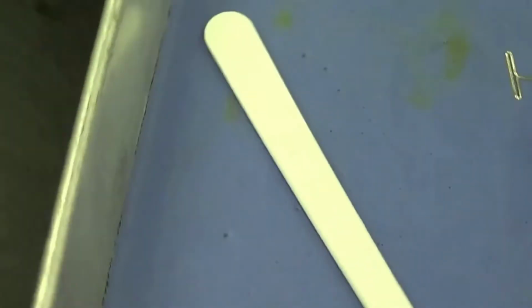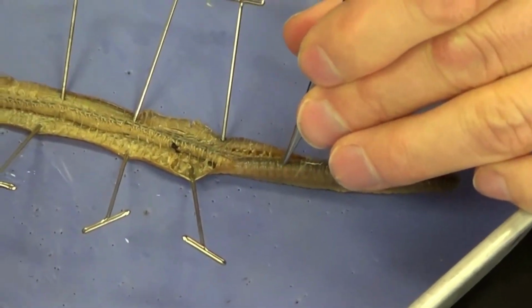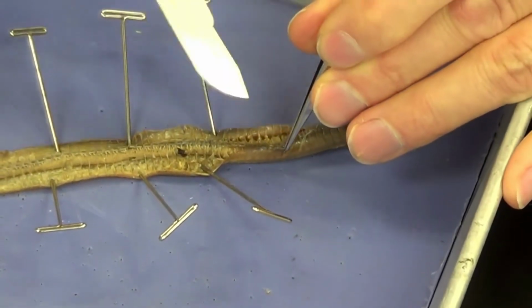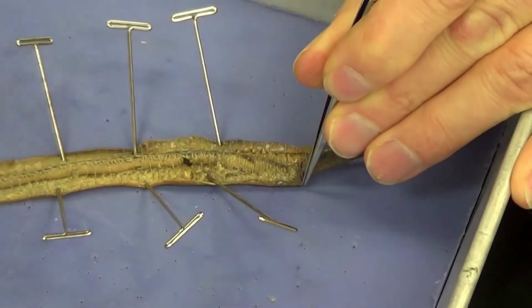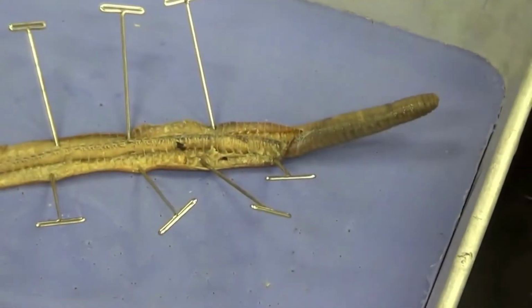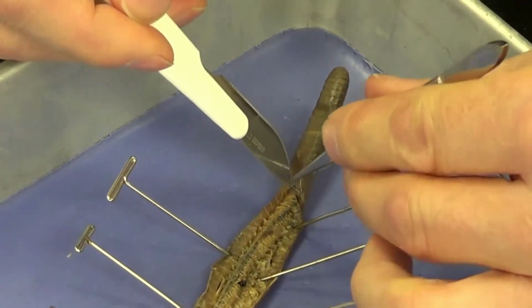I'm going to turn the pan again, and I just go back and forth until I complete this. So I'm going to reflect the skin a little bit here and cut those septa. Go ahead and I'm going to pin this. And I'm going to continue my way towards the anterior.